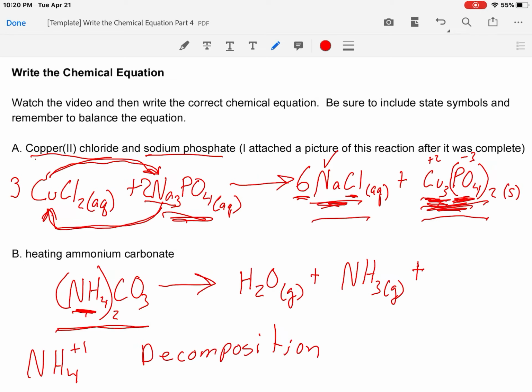Now, we've seen this a couple of times before. I lit the gas in the balloon with a lit wood splint. I put the wood splint into the bubbles from that big foamy hydrogen peroxide reaction. In the first case, the gas was burning. That was hydrogen gas in that balloon that was burning when I hit it with the wood splint.